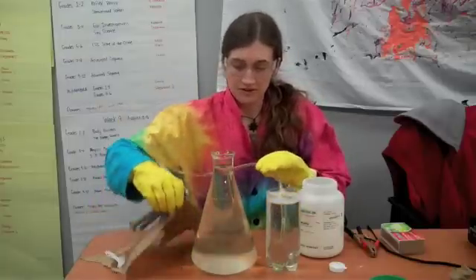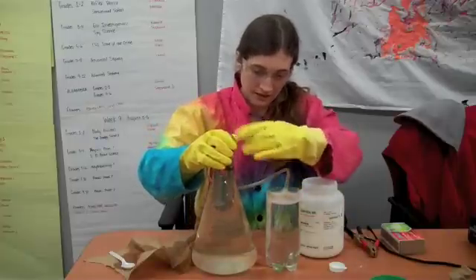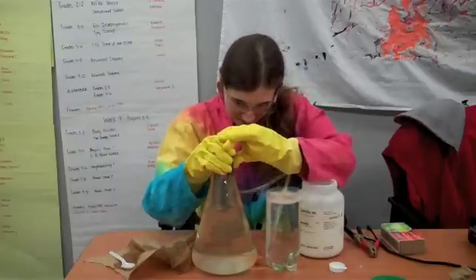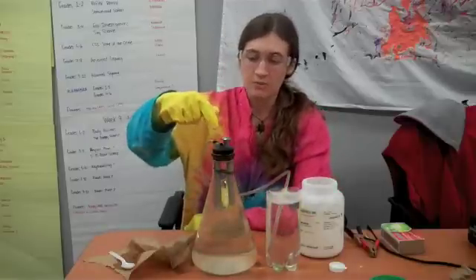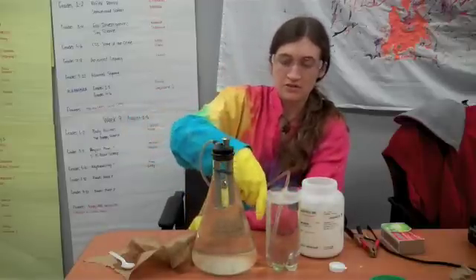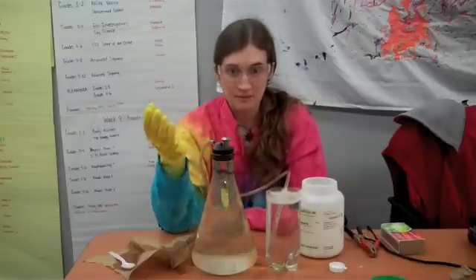Next, I'm going to put this airtight cork on here. The cork has two metal electrodes, you can see, and it has a tube. The tube runs into some soapy water here, and this will be able to catch the bubbles that are being made.